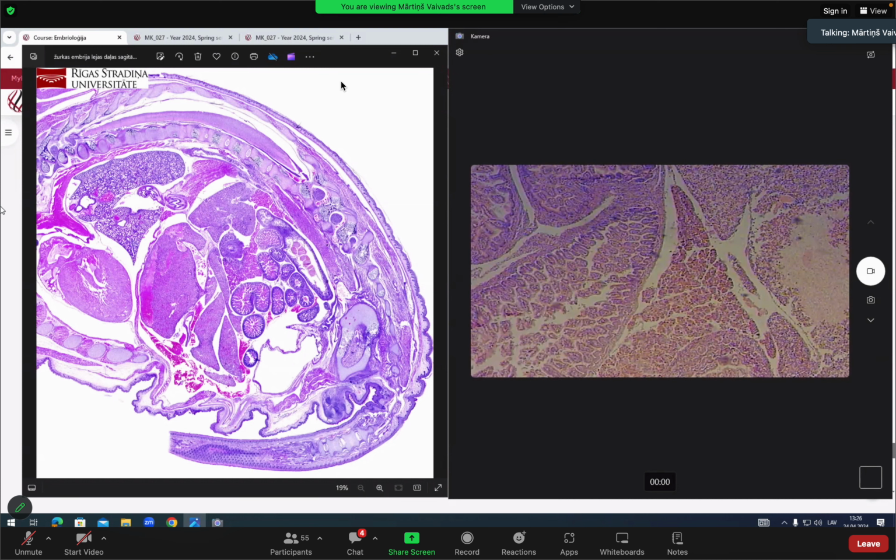In the picture, I will show you the area where the pancreas is. All of this is the pancreas. In red color, that is the pancreas. So number one, pancreas development. And in the slide, it's here. Slide name is pancreas development. And one, developing pancreas, and to be exact, the exocrine part.